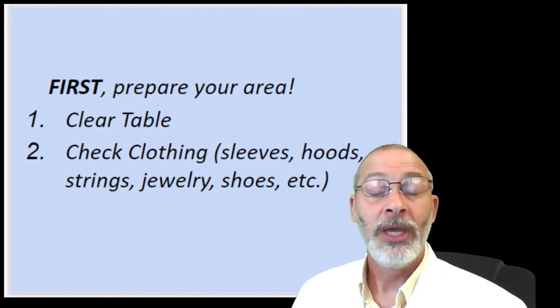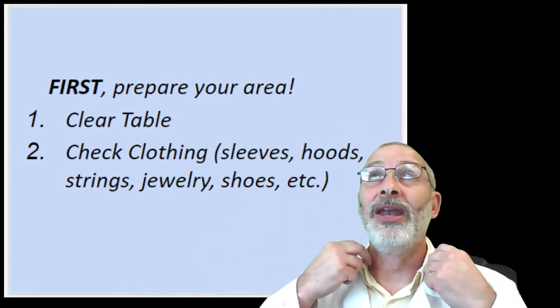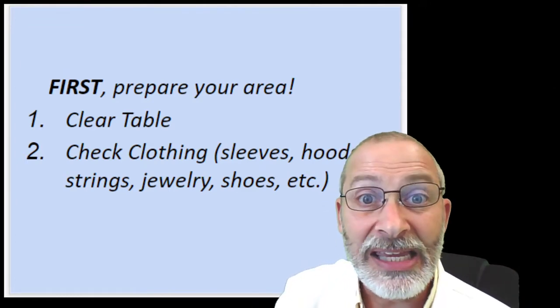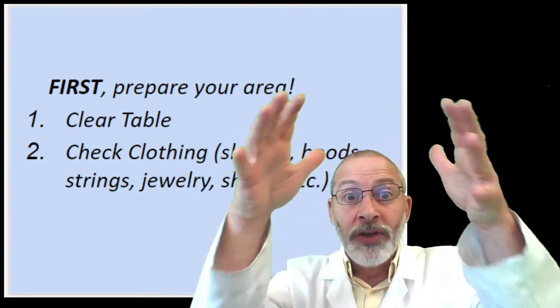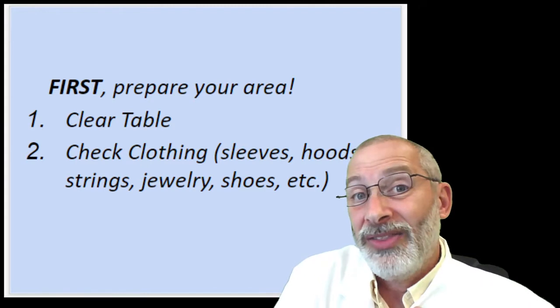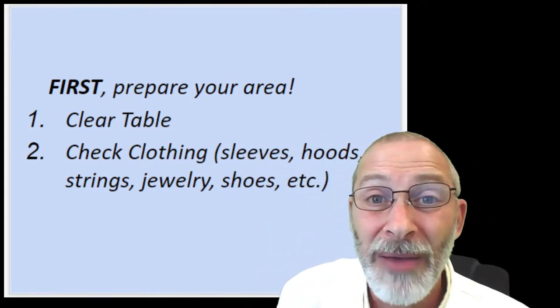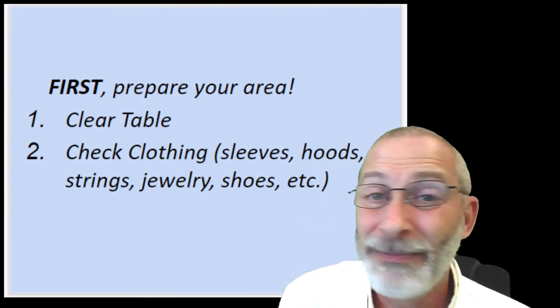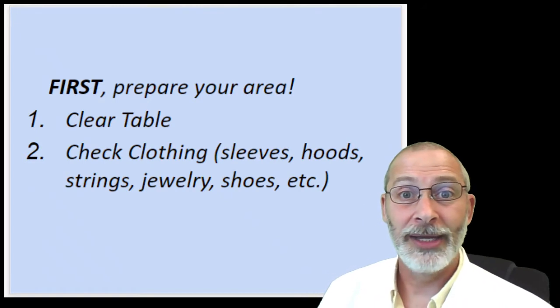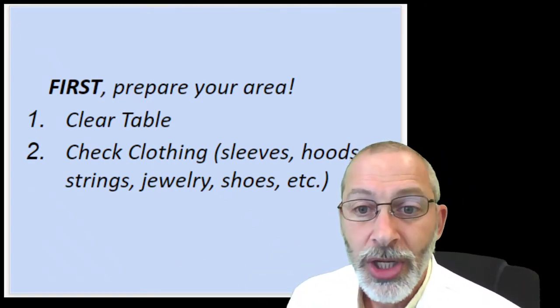No hoods. In addition, hoods that extend over your head like that, and hoods usually have strings, they can be dangling into the cone of heat around a Bunsen burner flame and could ignite. The strings could be dragging in chemicals, the residue of chemicals on the tabletop. No hoods. Hoods are not permitted. So no hoods on lab days. Strings, the strings I already mentioned.